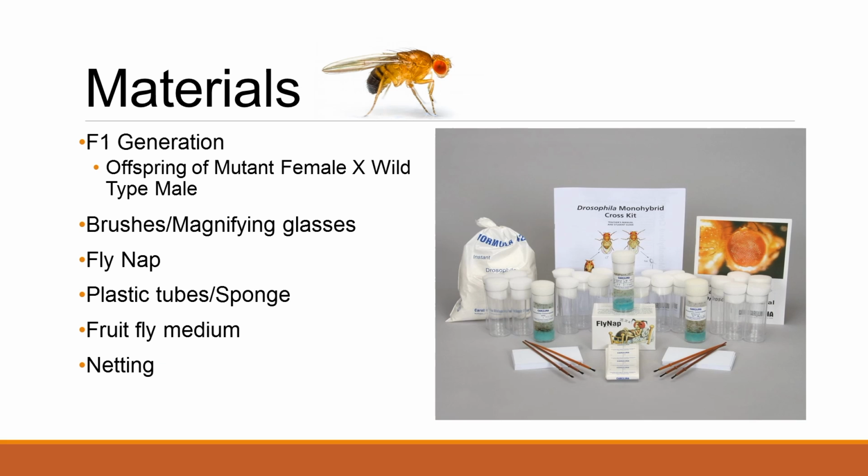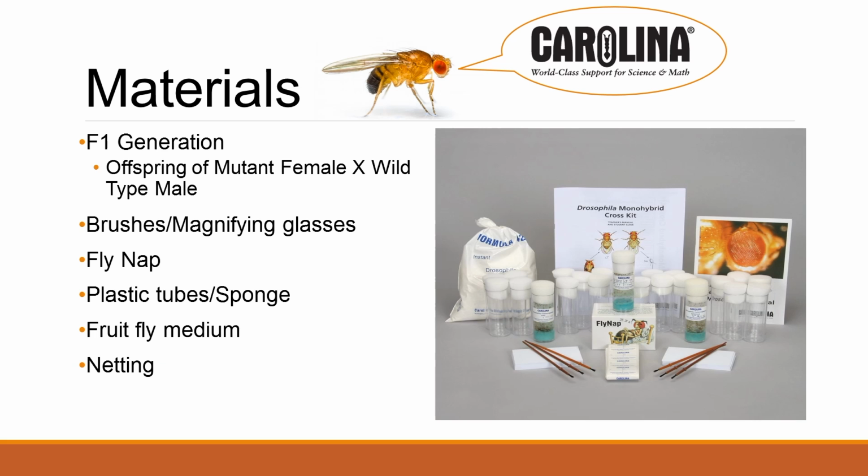And netting, which provided a place for the fruit flies to rest and lay their eggs on. And of course, all of these materials were provided by Carolina Biological Supply Company.